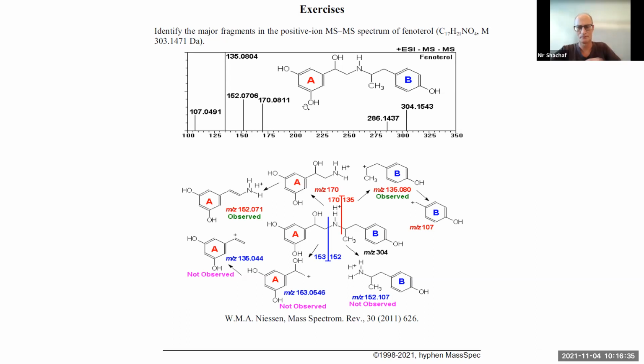Okay, thanks. And of course, the number of hits you get in the elemental composition calculation depends on the number of elements you have to consider as possibly being present. So it is wise to always think carefully, would it be likely that this particular element is there or not? And in some cases, what I do for unknowns is actually start out with a large number of possibilities.